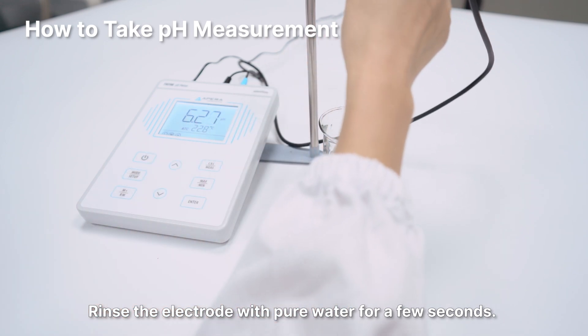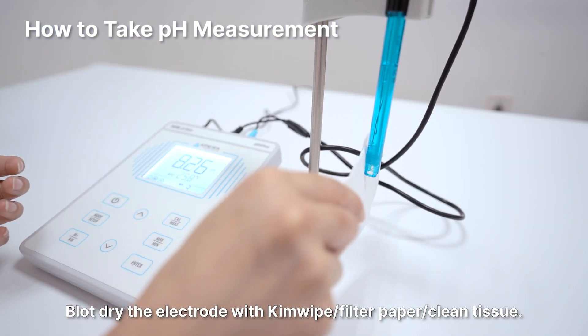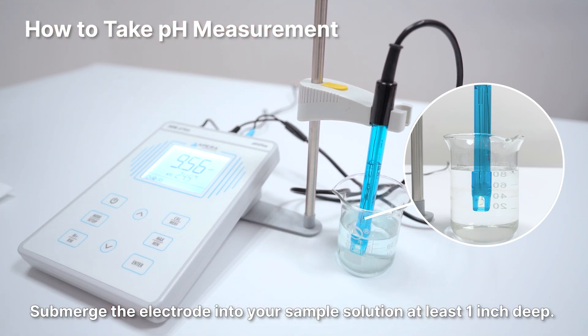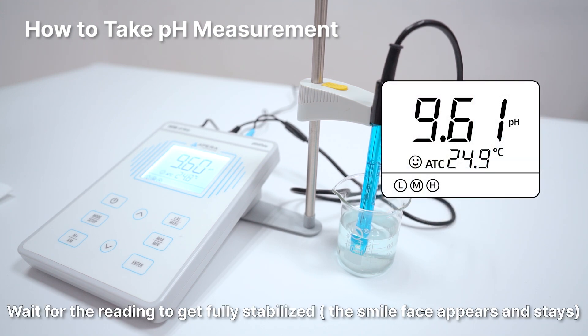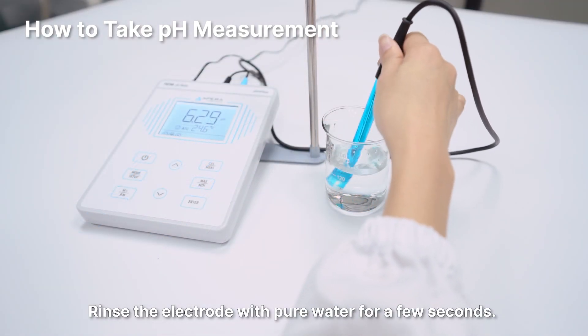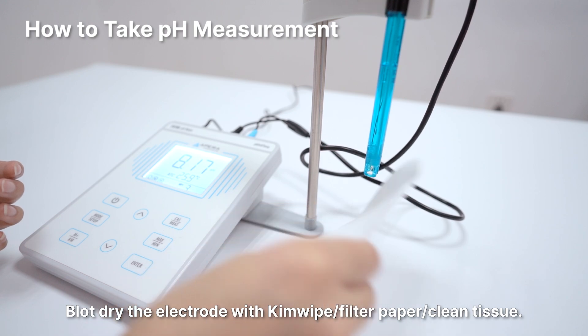How to take a pH measurement: Rinse the electrode with pure water for a few seconds and blot dry with kimwipe, filter paper, or clean tissue. Submerge the electrode into your sample solution at least 1 inch deep. Stir the electrode for a few seconds and let it stand still. Wait for the reading to get fully stabilized and then record it as the pH measurement. Rinse the electrode with pure water for a few seconds and blot dry.